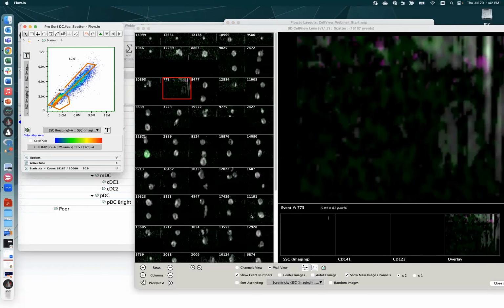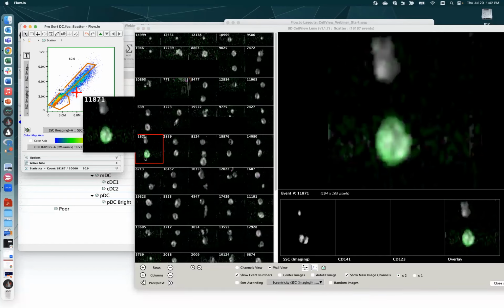Question: doesn't side scatter look better when data is taken at longer wavelengths where the transmittance to cells increases? For example, can data be attained at 730 nanometers and 780 nanometers? Transmittance of cells increases from 750 nanometers. Kanye, that sounds reasonable, but I am not your instrument person. I will pass that along to anybody who makes an instrument and is on this call to think about that. Okay.